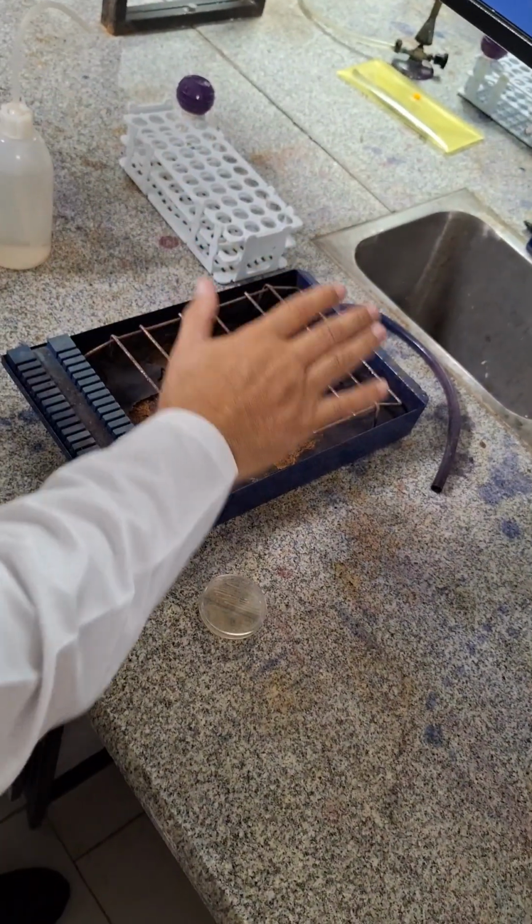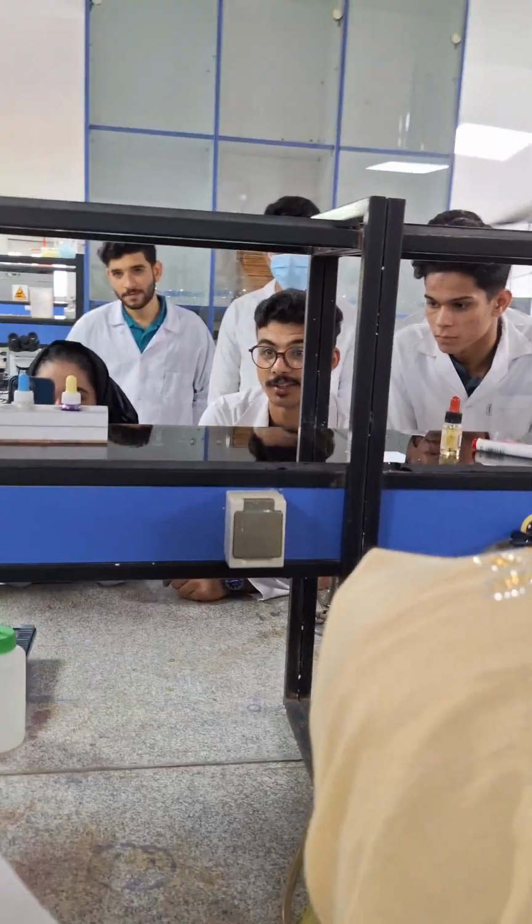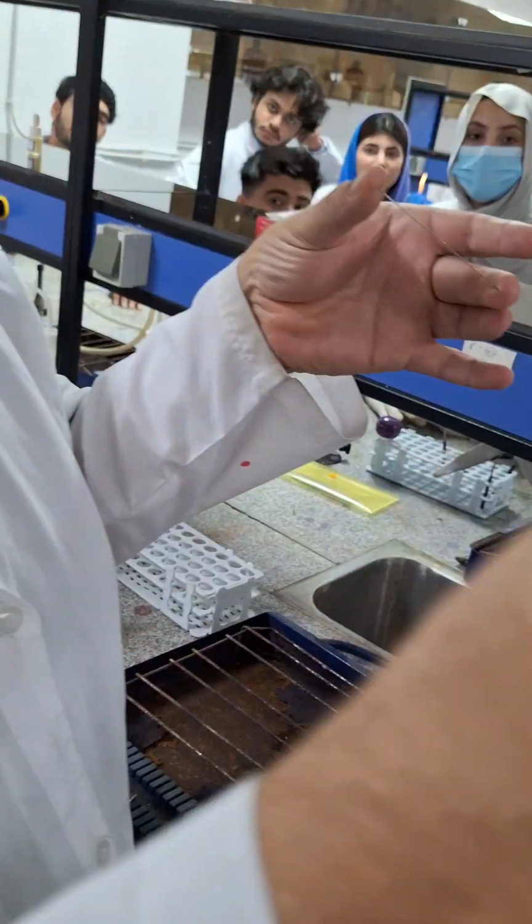After air drying, the second step is heat fixation. What is the aim of heat fixation? Fixing bacteria. Look here, this smear contains bacteria that can cause disease and contaminate yourself and your friends.